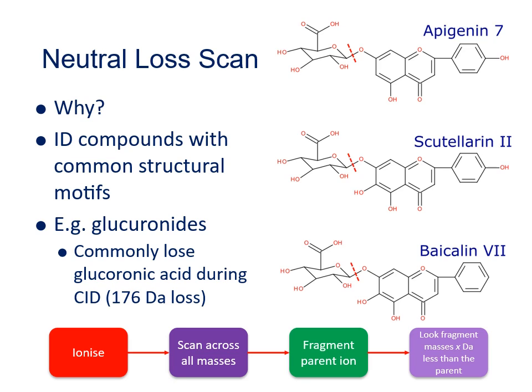So to find glucuronides in a sample using Tandem MS, we would get the first mass analyzer to scan across all masses, and then set the second mass analyzer to track the first mass analyzer, but with the mass of the second analyzer always being 176 Daltons less than the set mass of the first mass analyzer. That way we'll only get a signal on the detector for an ion which will lose 176 Daltons during the fragmentation stage.